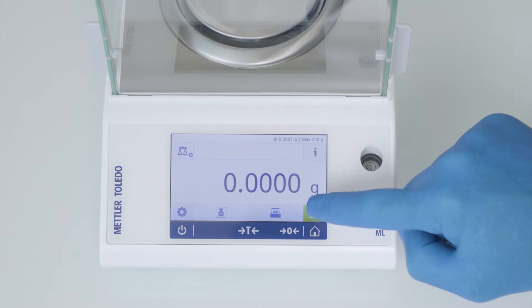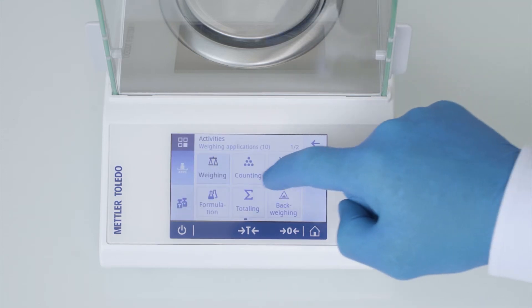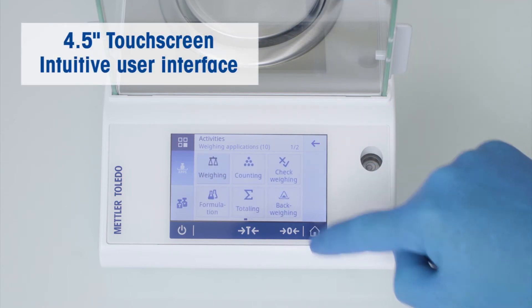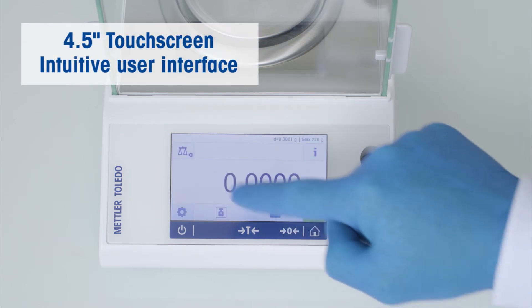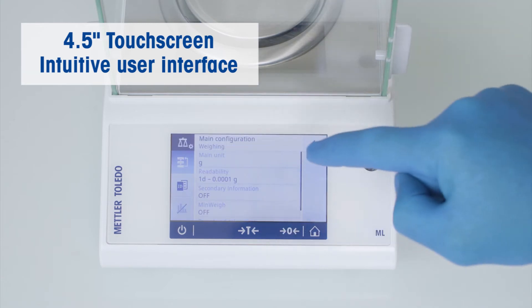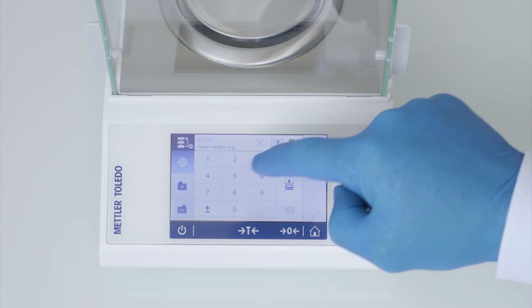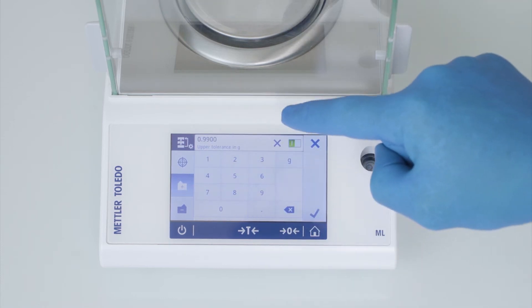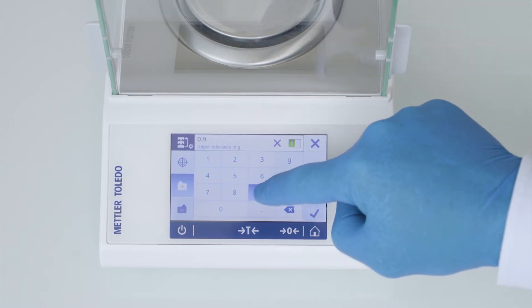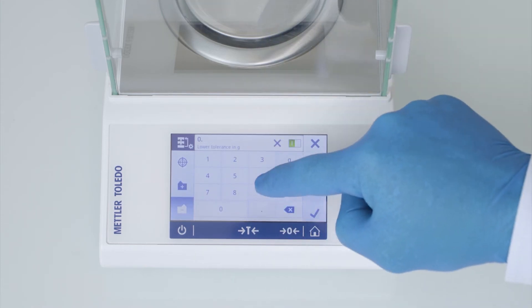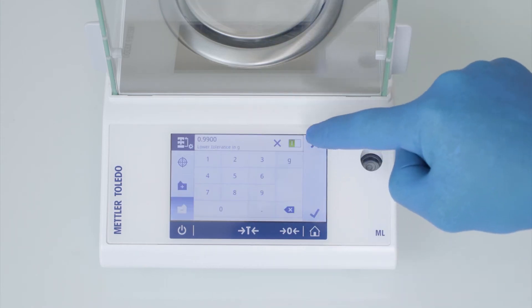Despite the compact design, you don't have to accept inconveniences in operating the balance. A very responsive and bright 4.5-inch touchscreen display with an easy-to-read measurement result offers an intuitive user interface to configure your balance according to your needs and support you in your daily weighing tasks with various clever solutions like the weighing-in guide with target and tolerances for sample preparation.